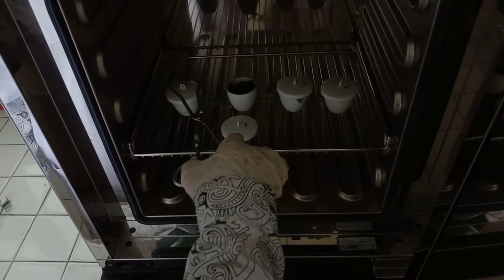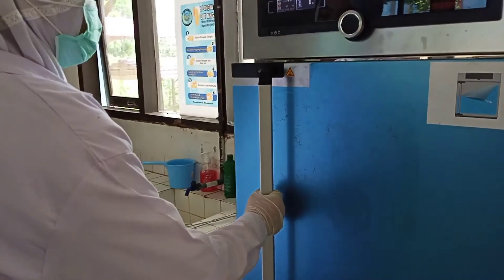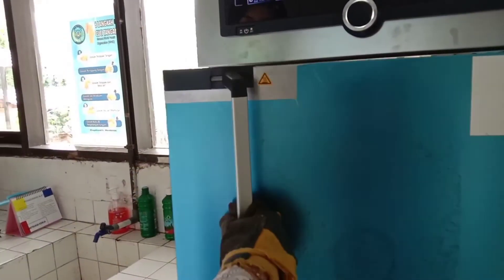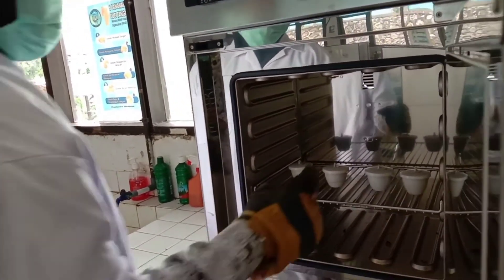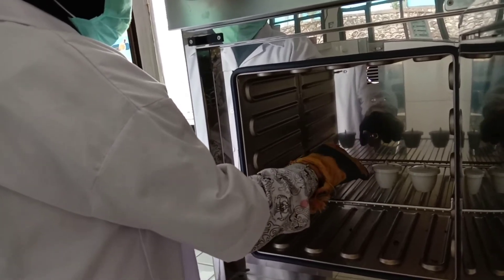Buka tutup cawan postelin untuk mempercepat proses pengeringan. Tutup oven dan tunggu selama 3 jam. Buka oven, lalu ambil postelin menggunakan bantuan sarung tangan grafi. Pastikan daun sudah kering.